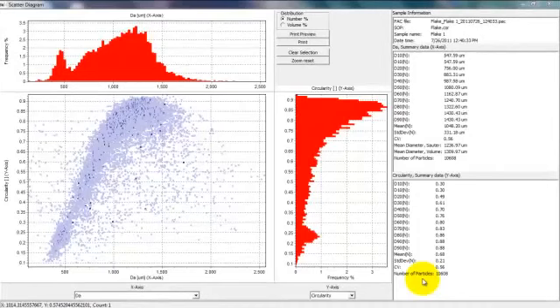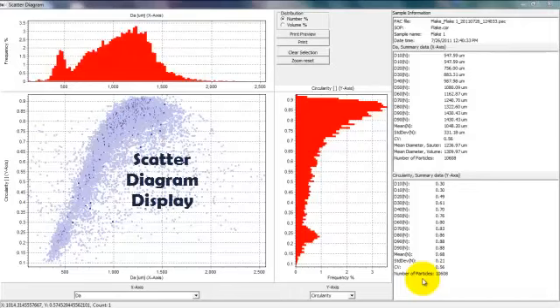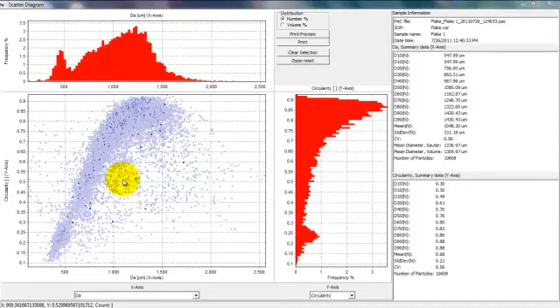Here's another parameter distribution display called a scatter diagram. This feature can provide additional useful information about the morphology of the particles. Any size or shape parameter can be displayed on either of the two graphs above the x-axis or to the right of the y-axis, the scattergram itself. The scattergram shows the position of every particle measured relative to the two parameter distribution graphs. Darker areas are areas of higher particle concentration.